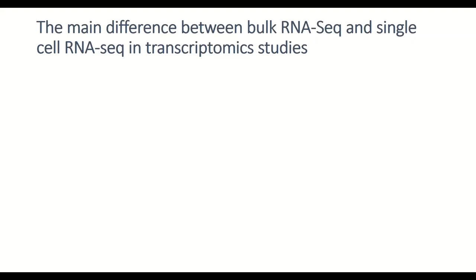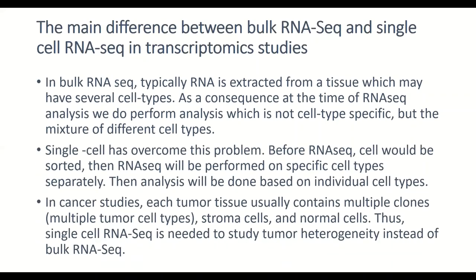So this is why right now there is a new technology we call single cell RNA-seq. Basically, we generate data on single cells, not a mixture of cell types, okay? This is extremely useful because for a specific tumor sample, once we extract single cells and submit the cell sample for sequencing, we are able to generate data for each cell. In this way, we are able to estimate the so-called tumor heterogeneity. This technology is relatively new, but more and more PIs are using this single cell platform to generate RNA sequence data and DNA sequence data to study cancer, okay?